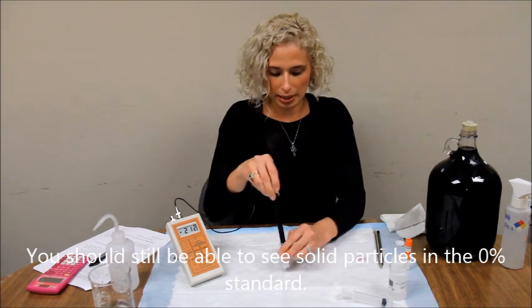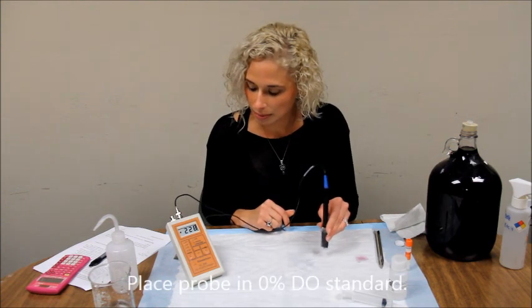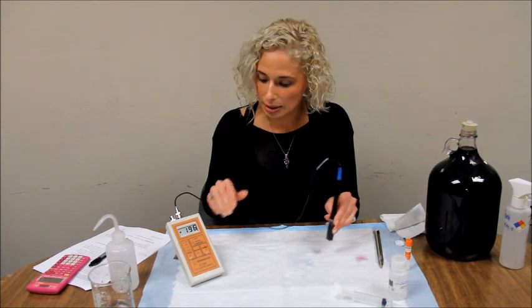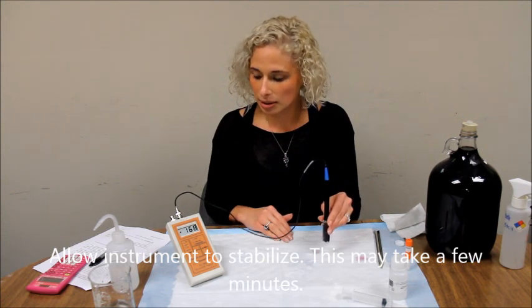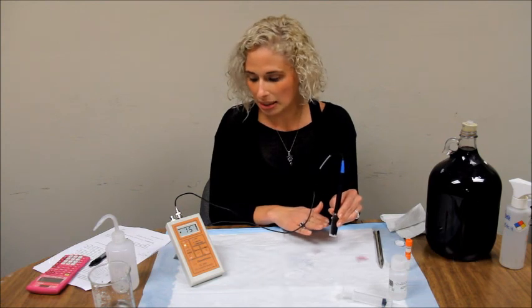Now go ahead and put your DO probe in the 0% standard and allow the numbers to change and stabilize. This may take about a minute for the 0% standard. Just keep the probe steady in the solution.